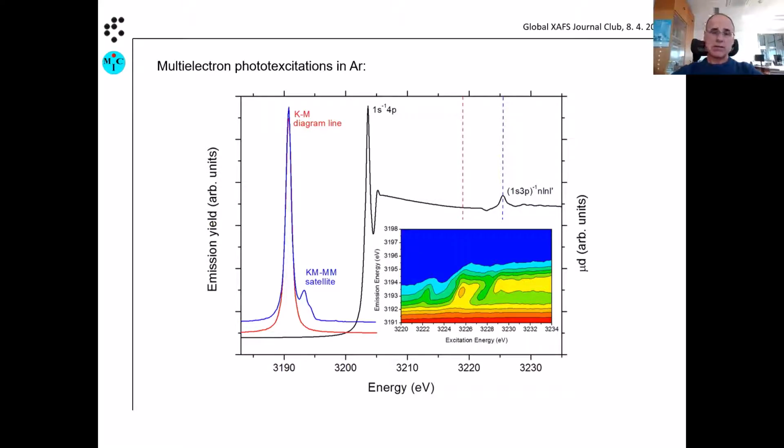And you can see here, this is a bit condensed, this slide, you can see the absorption spectrum, and you can see another tiny feature there, above 25 eV above the main edge, like another small edge is opening, and this is, of course, the multi-electron signal. So this is no structural signal, now we are dealing with an atomic target, and it's clearly visible in the absorption spectrum. And it has been extensively studied, of course, in the 90s.